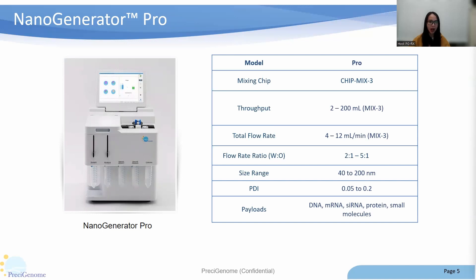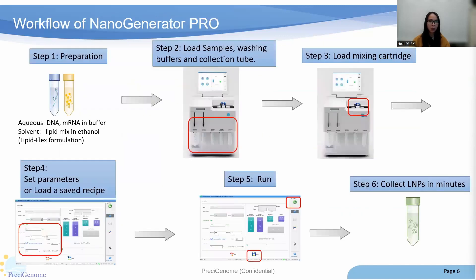The system has a user-friendly interface with a touch screen. Users can set up their experimental parameters conveniently and directly on the Pro. The operation of Nanogenerator Pro is very simple.